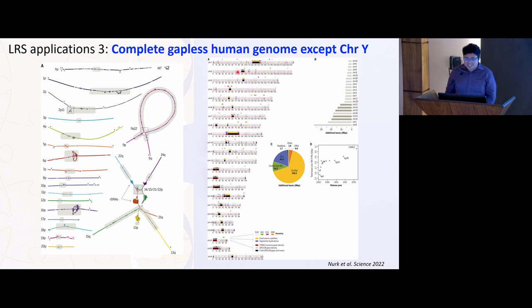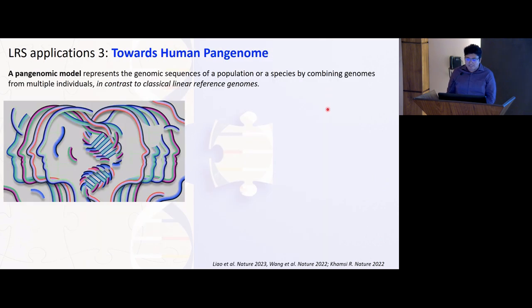I don't know why. So this black and red portion that you can see are the sequences of DNA that have been introduced using long read DNA. Can anybody tell me why chromosome Y is not sequenced in this? Yes. Nikhil sir has told you this is the complete hydatidiform mole, which is 46,XX. It doesn't have a Y chromosome. That is why it remains to be sequenced.